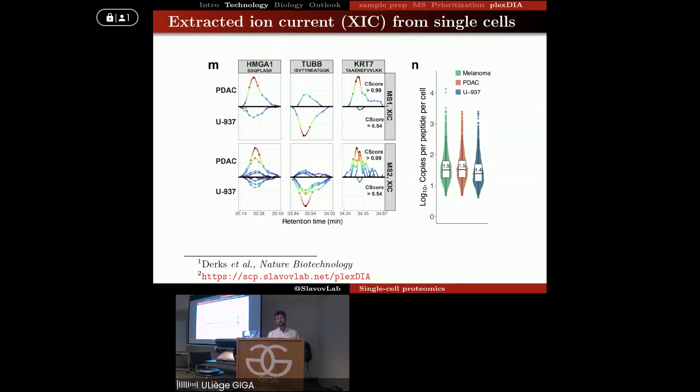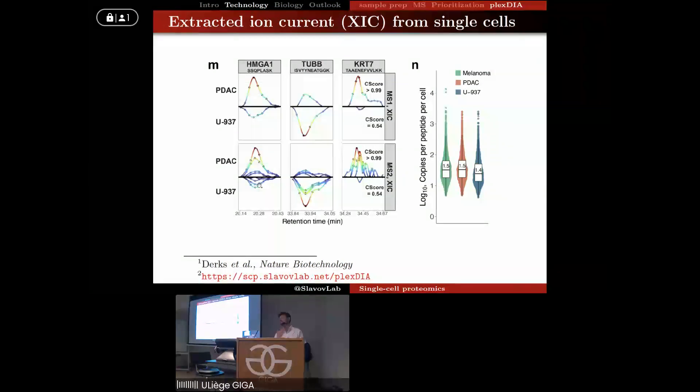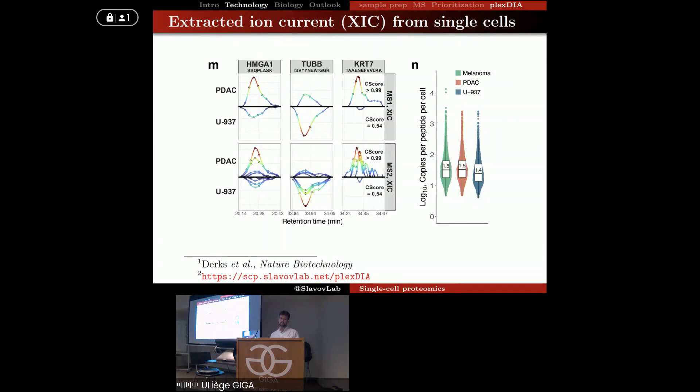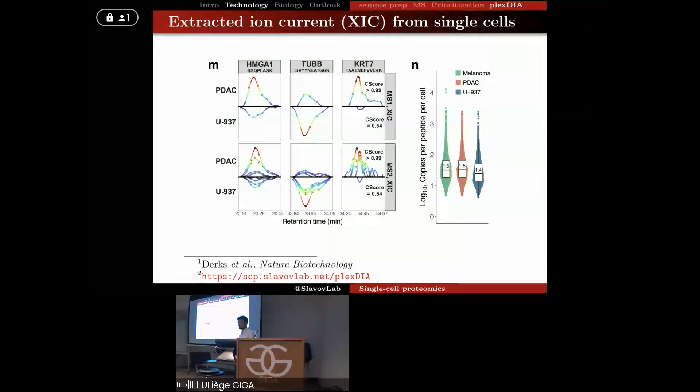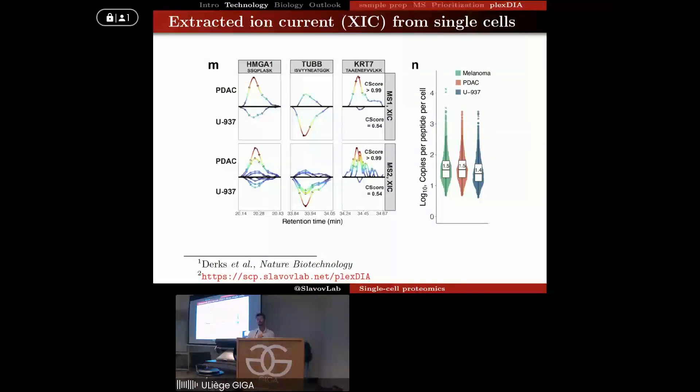Maybe I'll just take a few minutes more to tell you about the technology. I'm eager to transfer to the biology section, but I don't want to skip this one because I think it's pretty cool. So here you can see a particular peptide ion as it elutes from the chromatography. This is the precursor in pancreatic adenocarcinoma cells, and this is another single cell - a monocyte - and you can see again the same peptide eluting. This is part of the same experiment, and here you can see the fragments of that peptide eluting. So based on the consistency of this data, we can start having a lot of confidence in the raw data and in the accuracy of both identification and quantification.